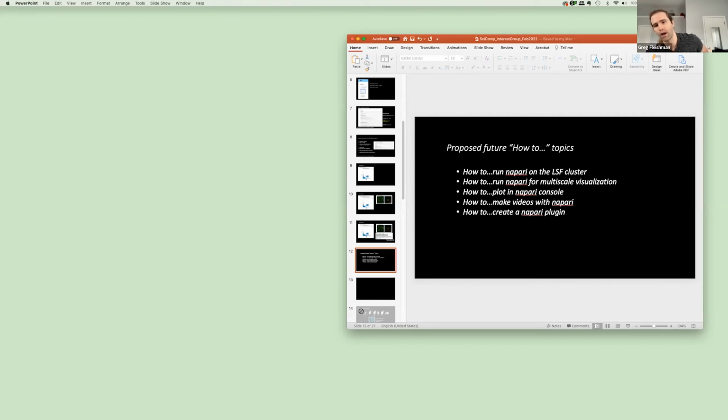Oh, okay, so you made your own Python-based ROI editor. Have you done any manual work in Napari? Primarily because you can definitely annotate in Napari, but I don't know about the functionalities. I don't think it can interpolate across different slices, because we have these 3D images, the cells are in 3D. I don't think it currently has these interpolations in Napari. Might be able to do it elsewhere, but that's why I didn't do it there. That's why I tried Paintera and, as you said, TrackEM too, these kinds of applications.